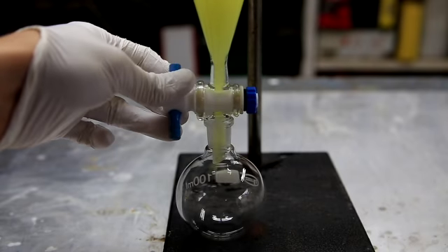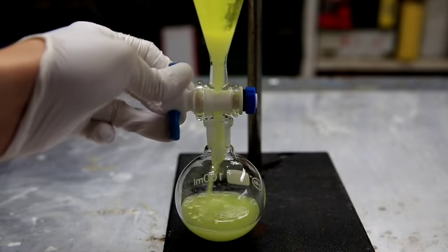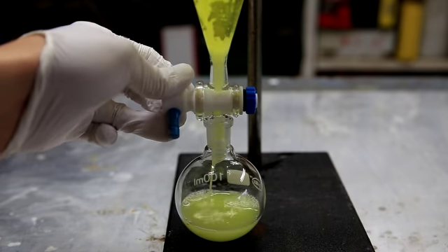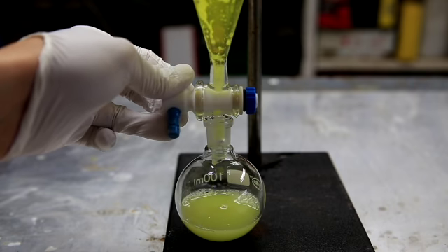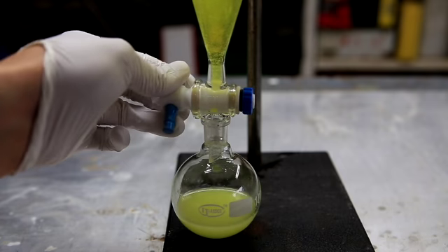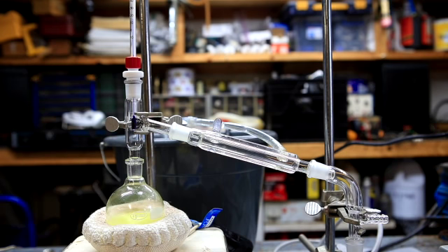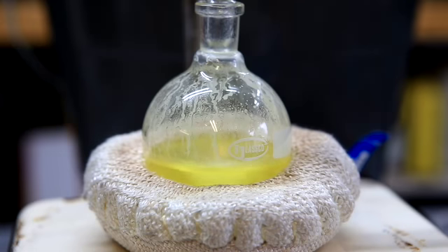After the final washing, the nitrobenzene is transferred to a round bottom flask, and due to the presence of water, you can see that the solution is quite opaque. To further purify the nitrobenzene of water and of the di and trinitrated product, we're going to carry out a simple distillation. The fraction that started coming over at around 208 degrees Celsius was collected.